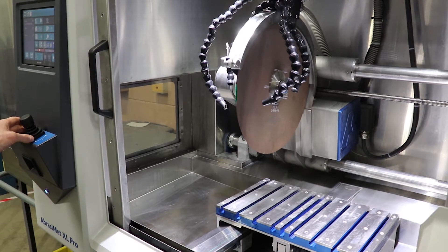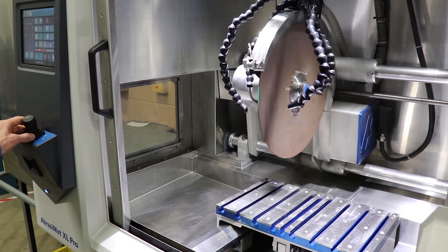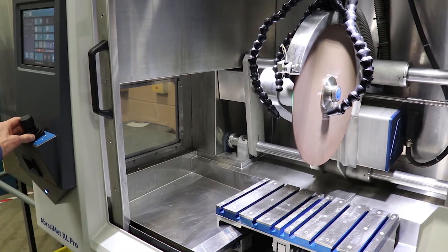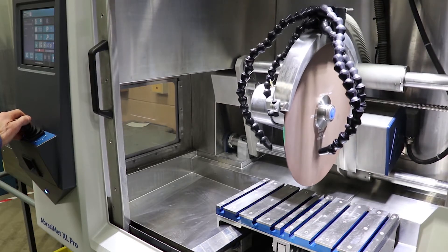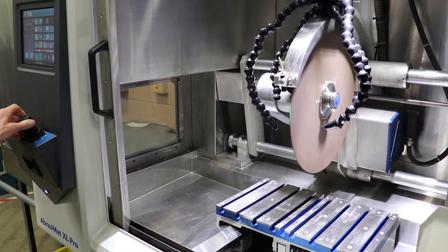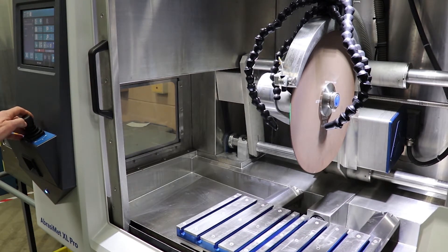This is a three-axis machine. You can move the blade in the X direction to serial cut in any location you want along the X. The blade also moves in the Z direction in a typical chop cutting type application. The vice table also moves in the Y direction, both in the positive and negative Y.